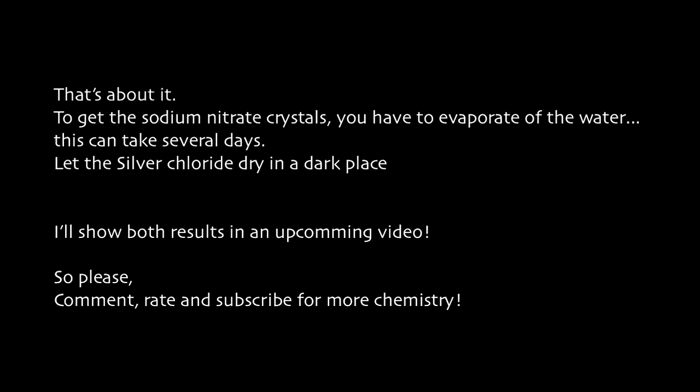That's about it. To get the sodium nitrate crystals, you have to evaporate the water. This can take several days. Let the silver chloride dry in a dark place. I'll show both results in an upcoming video.